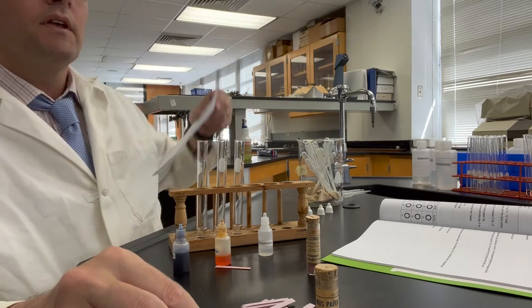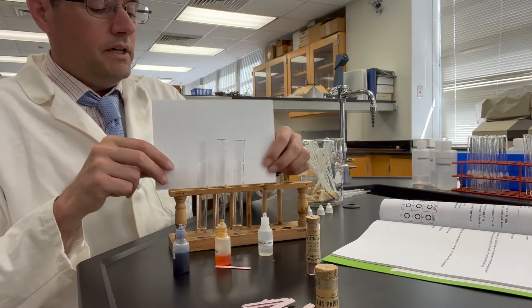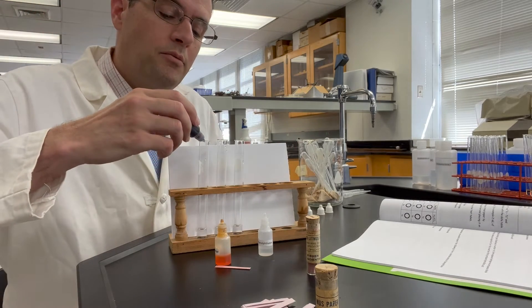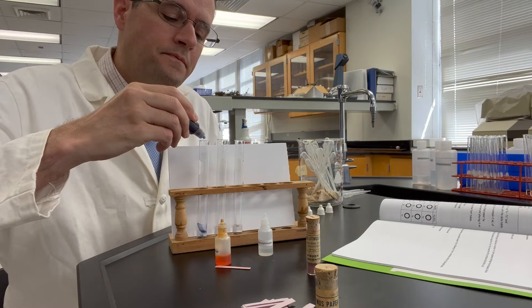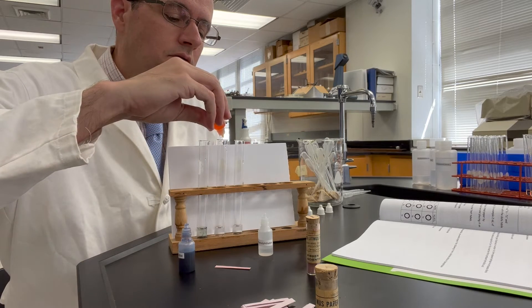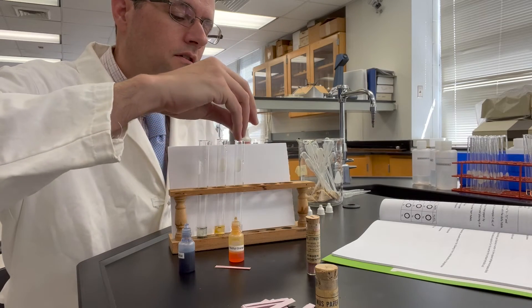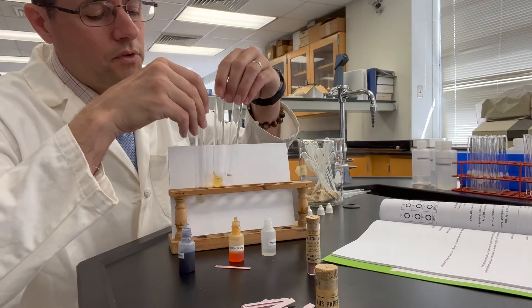I don't see much difference at all on the camera. So now let's go ahead and add our indicator. We've got thymol blue — I'm going to add two drops here just to make the color a little bit better for our camera. Methyl orange in the middle, and phenolphthalein on the very right. We'll stir those up and then observe.